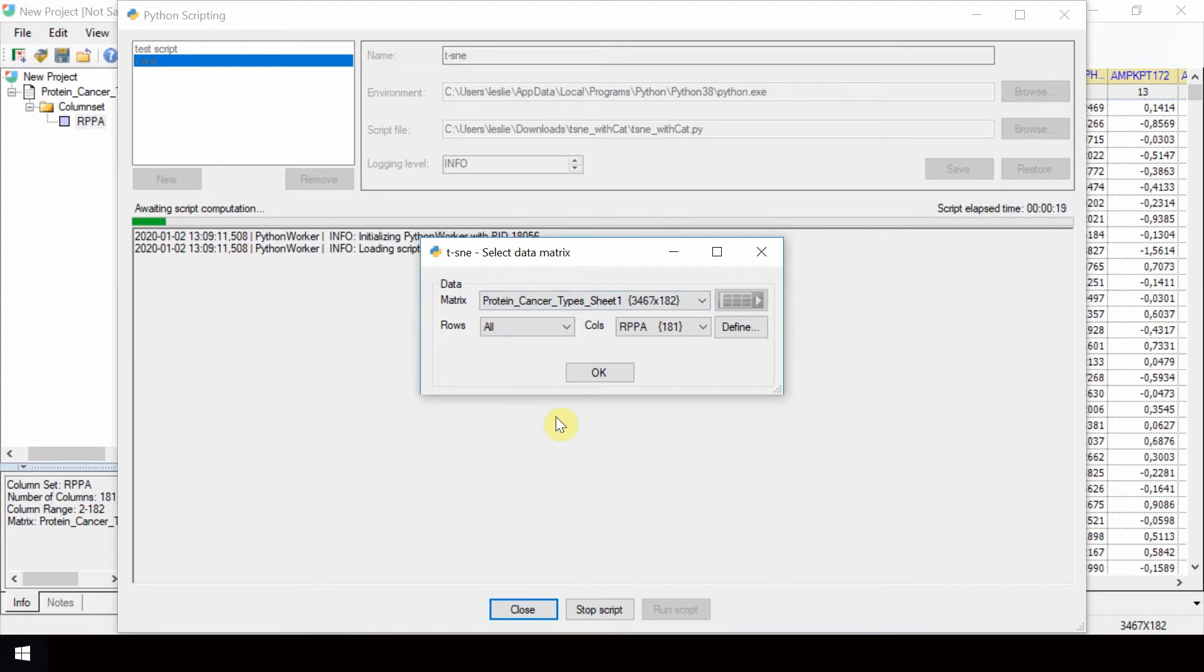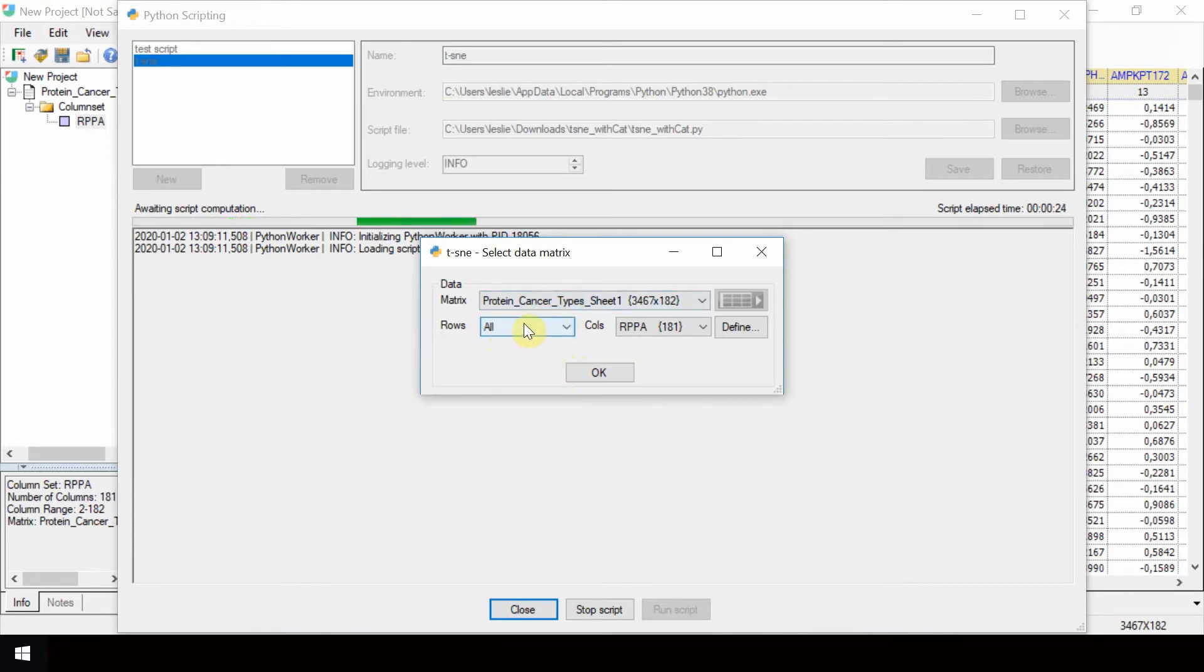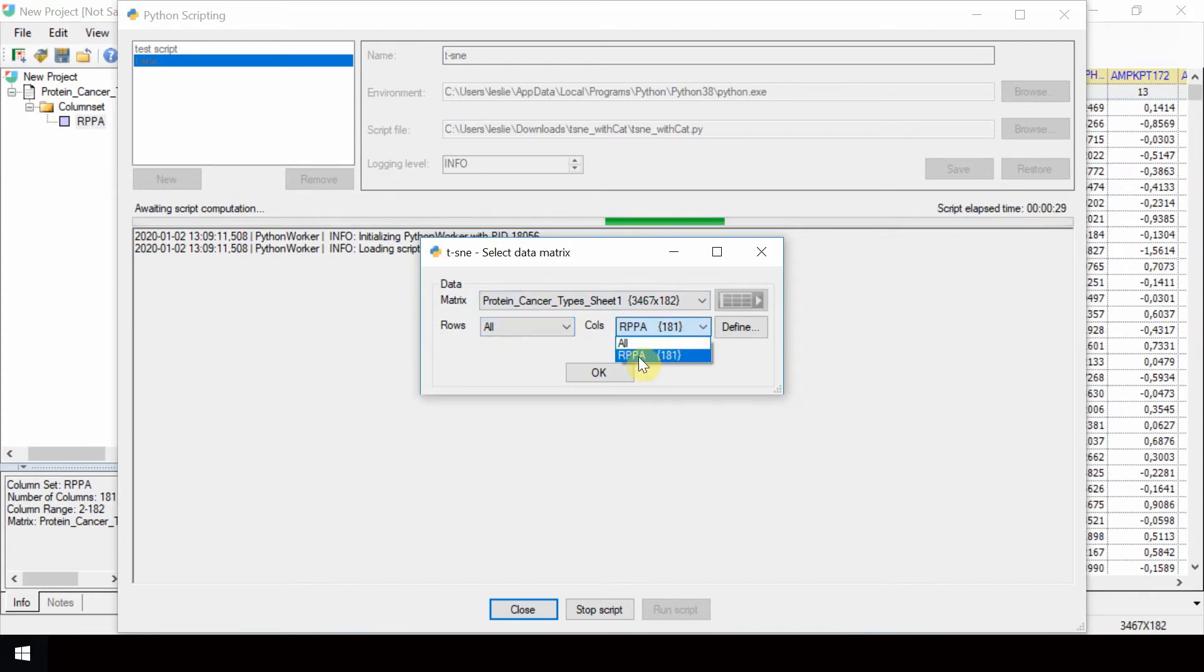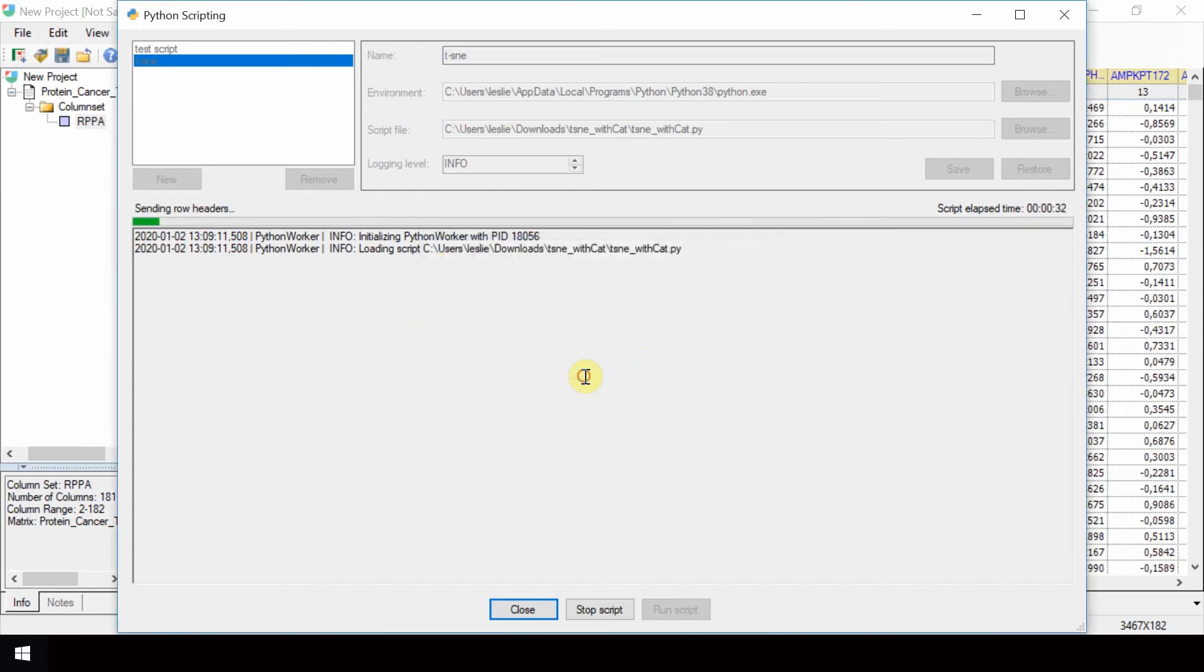The data table to use is protein cancer types previously imported. Select all rows and the previously defined column set, RPPA. Click OK. Click OK.